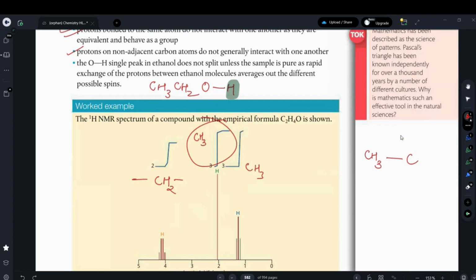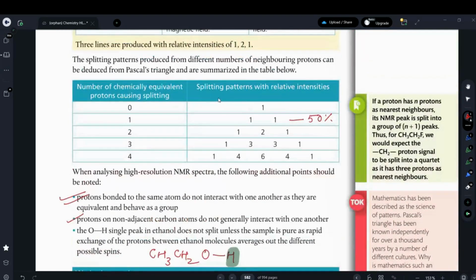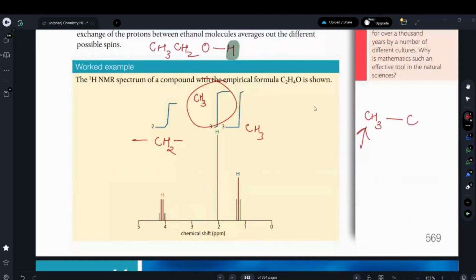Do you understand? So for this particular carbon and the hydrogens attached to it, you are getting the peaks here. You understand my point? So that is only relevant if you have zero hydrogens attached here. So that means this particular carbon should be C double bond O. Understood? And there should obviously be O attached next. Clear? Okay. Look at the next one.